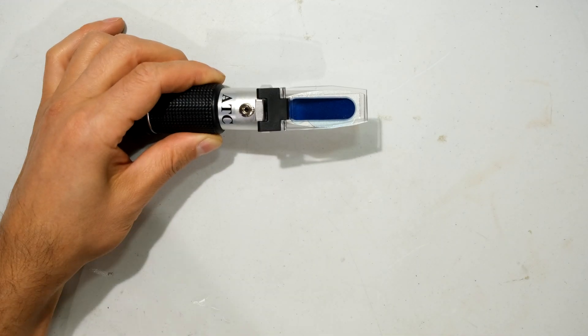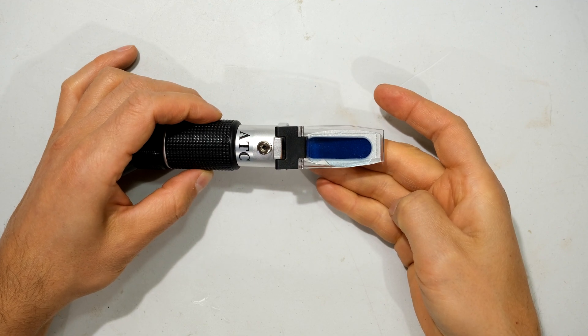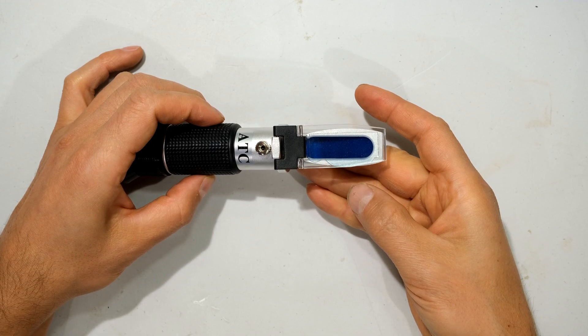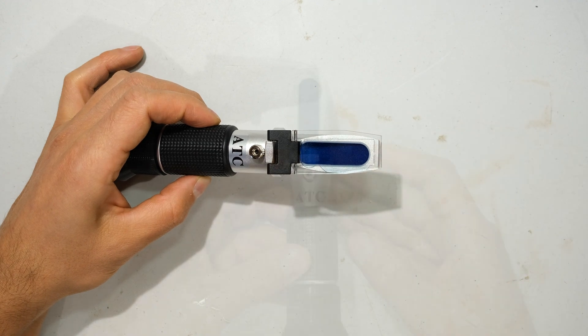In this case the temperature is 21 degrees. When using your refractometer, there is a recommended range of temperature measurements: between 10 and 26 degrees Celsius, or 50 to 80 degrees Fahrenheit.